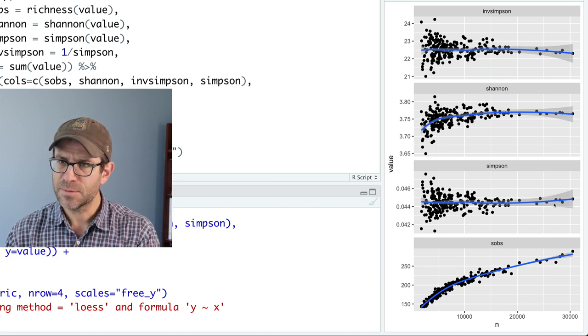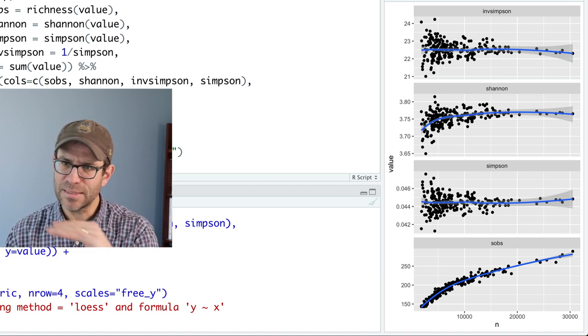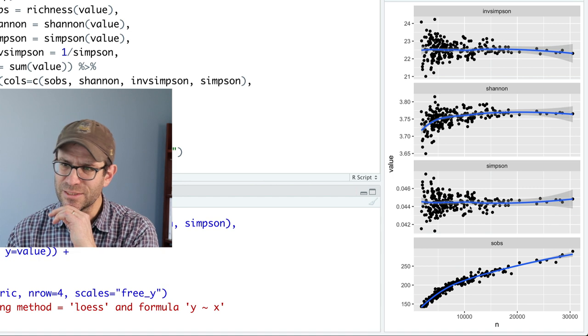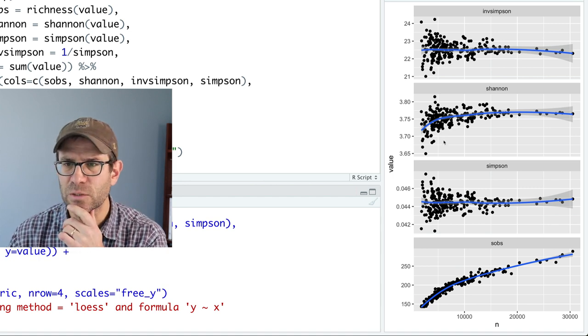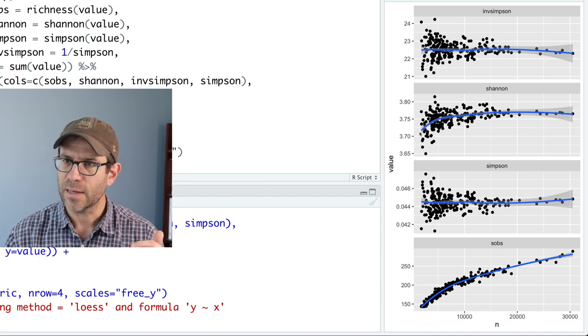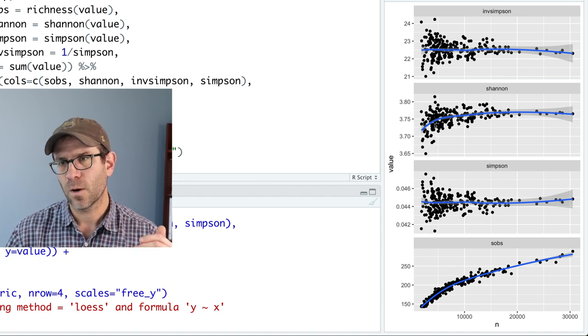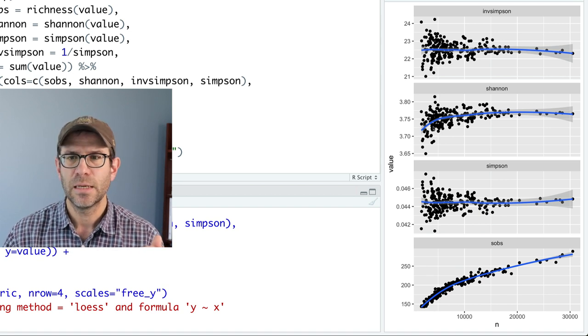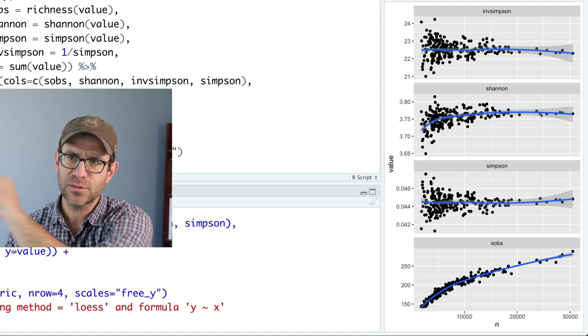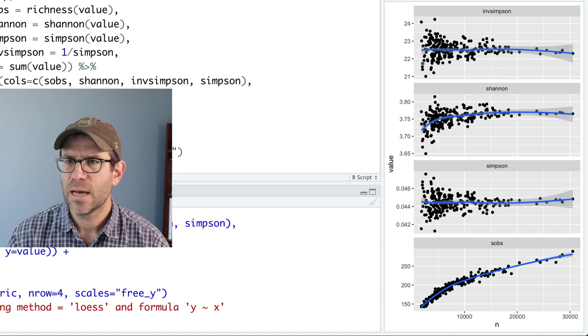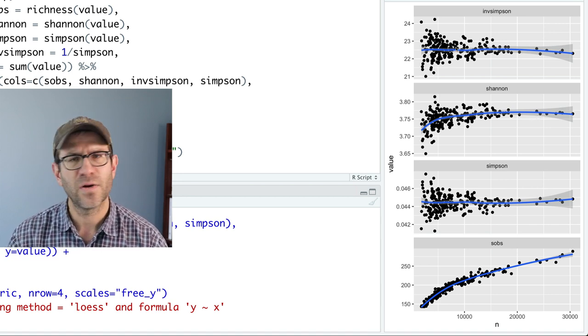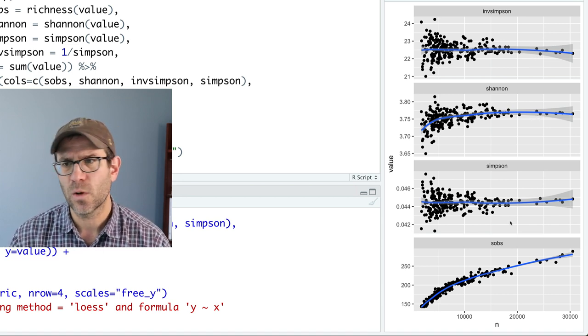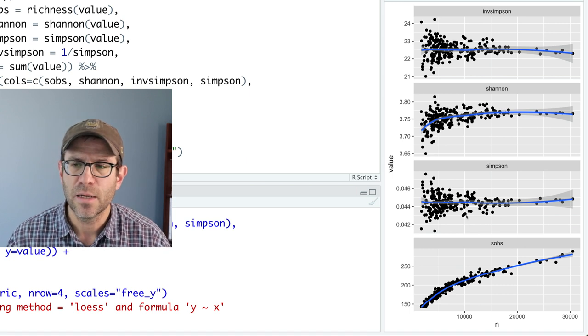Simpson seems pretty flat. Maybe it's increasing a little, but I don't think so. Shannon seems to have some effect where kind of in the first 5,000 sequences being sampled, there is an increase in Shannon, but that does also seem to kind of plateau. Inverse Simpson seems fairly flat as well as you'd expect if Simpson were flat.